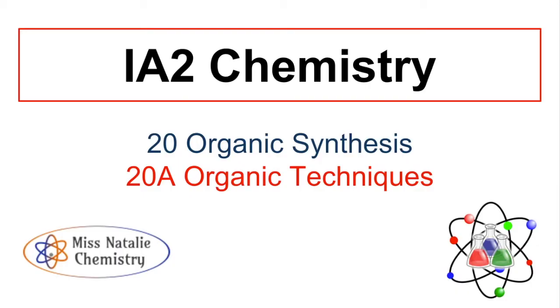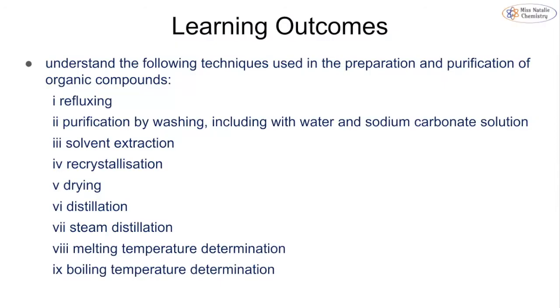This video is going to be looking at the very last topic of A2 chemistry for Edexcel International A-level, and it's going to be looking at the organic techniques that we use in organic synthesis. So it's all about the techniques that we use in order to prepare and purify an organic compound.